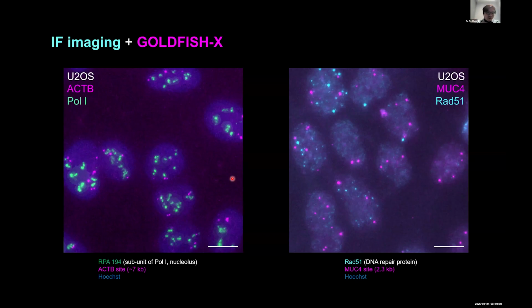And the answer is actually yes. So we have tried a few settings where in one case, on the left, we label the larger structure within the nuclei, the nucleolus, and you can see the nucleolus and DNA FISH signal can coexist in one set of experiments. And for these genes, we're not expecting any colocalization or anything.